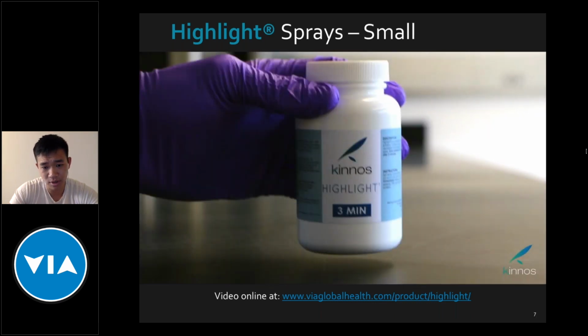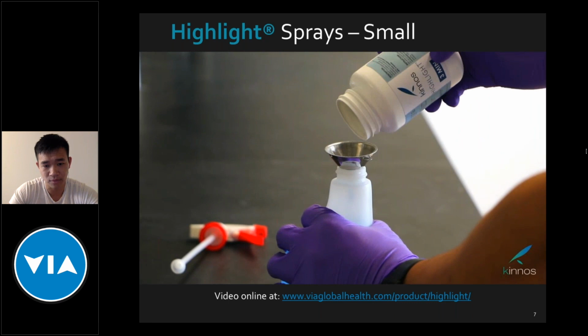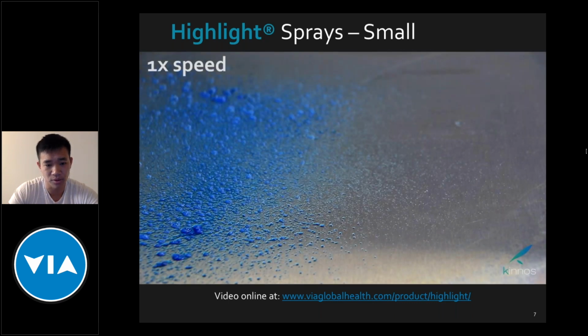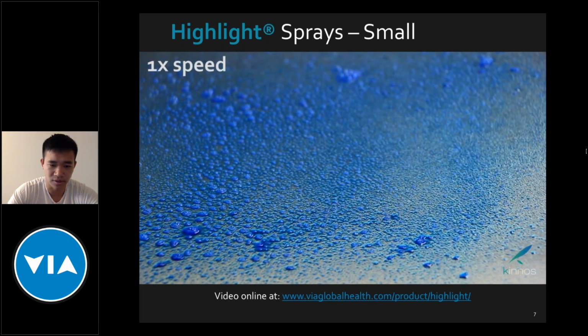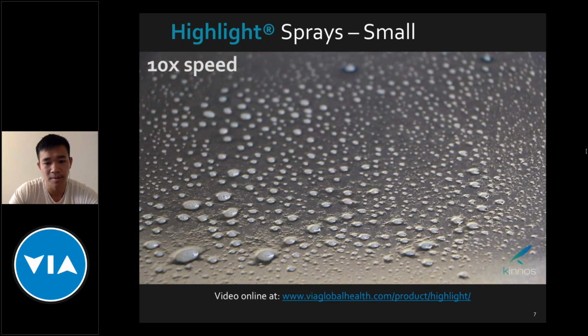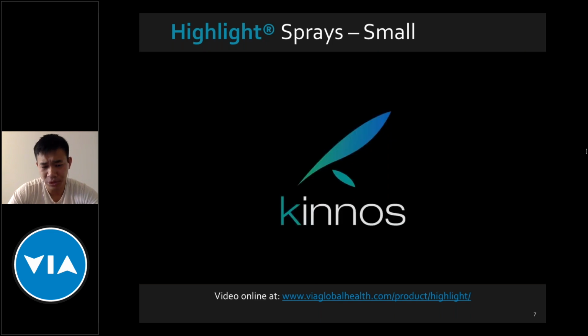This is our smaller bottle size. It's meant for those trigger sprayers you might use in a laboratory. And it's currently being used in a variety of biosafety scenarios. So both of these videos are online on the VIA Global Health website, where you can watch them again.